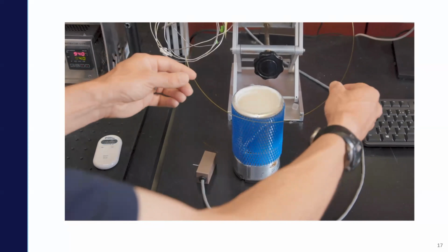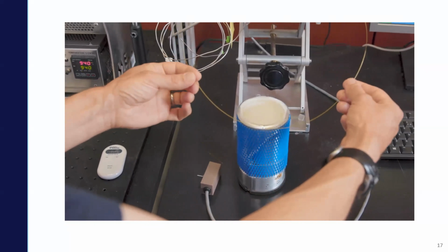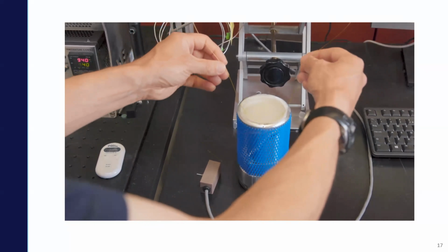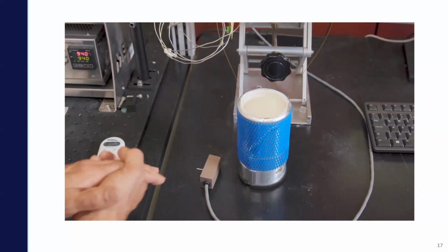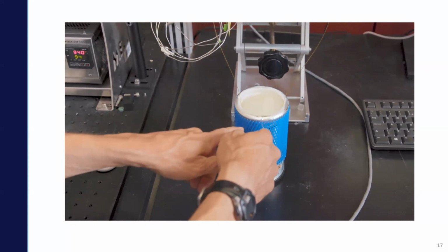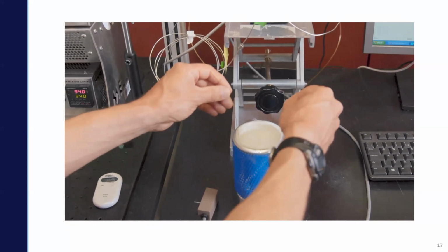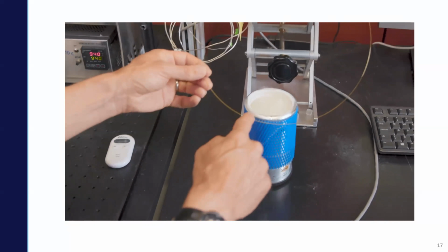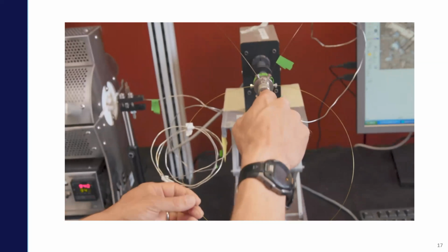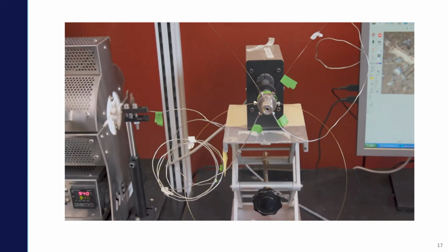The CO2 generated from the combustion reactor passes through this capillary. When we place this capillary in liquid nitrogen, it cryotraps all that CO2 into a very small area of the capillary. Once we've trapped enough CO2, we can remove the capillary from the trap, and as it warms, the CO2 sublimates away, is carried by the helium carrier gas through the rest of the line into the isotope ratio mass spectrometer where we make our measurement.